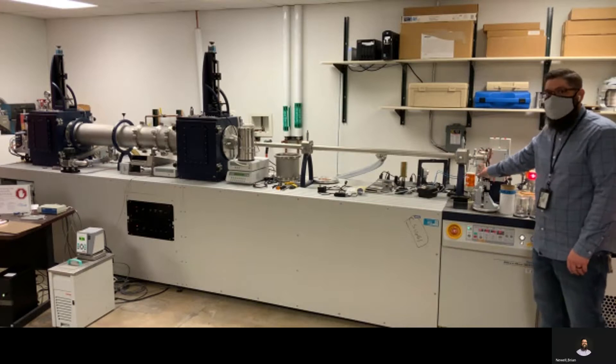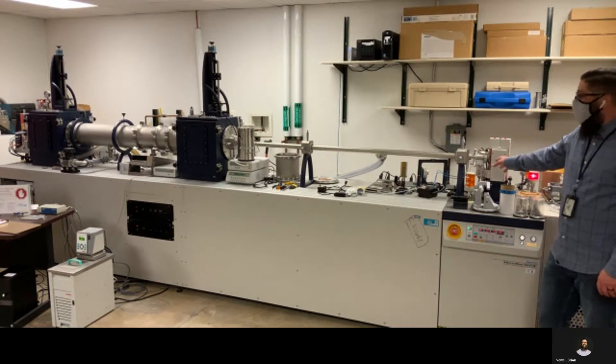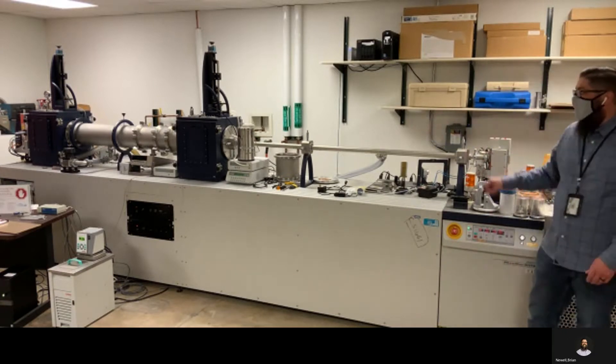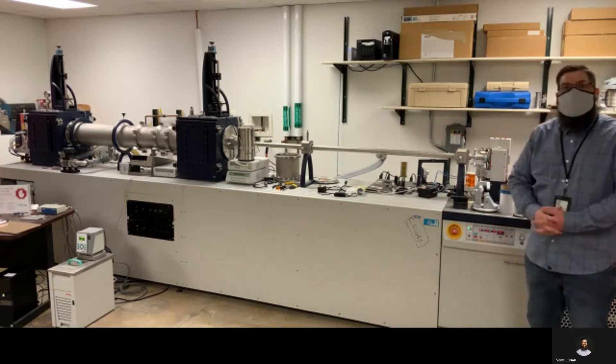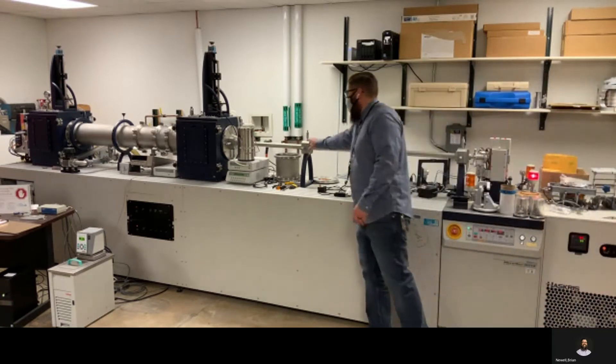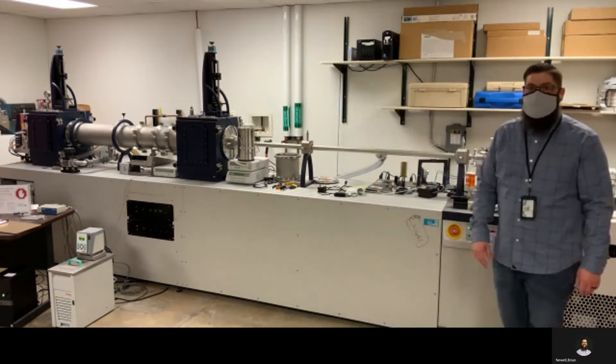We have a Bragg optic here that we're using to filter out the wavelengths that we don't want. Then we have a flight tube with three pinholes, the first two of which are actually attenuating the beam. So by the time the beam leaves the second pinhole here, it's 300 microns in diameter.